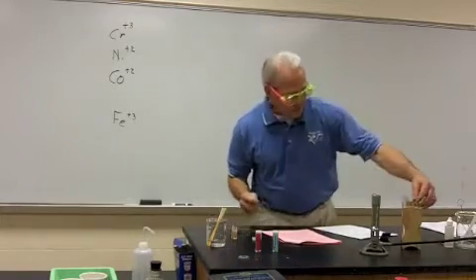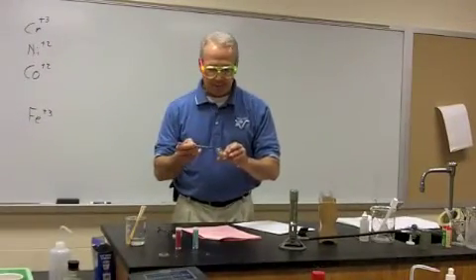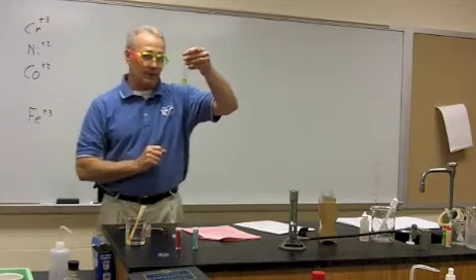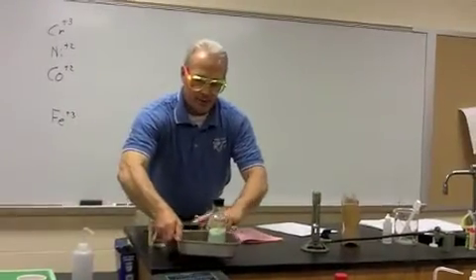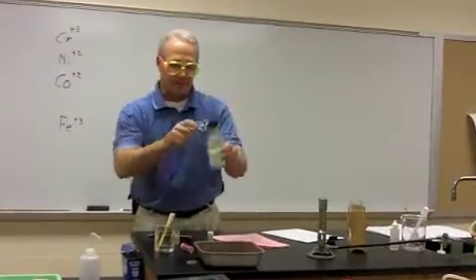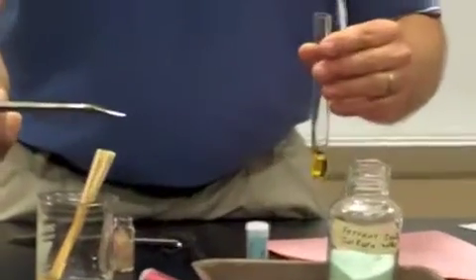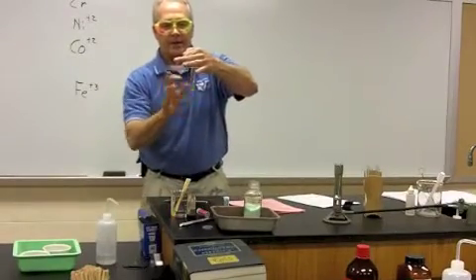Well, to do the brown ring test, what we do is take an unknown, again, take a small sample, and we'll dissolve this in water. Now I have the sample here already, so we have our nitrate, or our unknown, dissolved in water. And what we want to do is add a 1/4 scooper. Now I have the iron 2, as it says, this is ferrous sulfate, which is iron 2 sulfate, so it'll be in this container. It says a 1/4 scooper, so if we get a zoom in on that, it looks about just like that. Okay, so we'll add that to our unknown and shake it up.